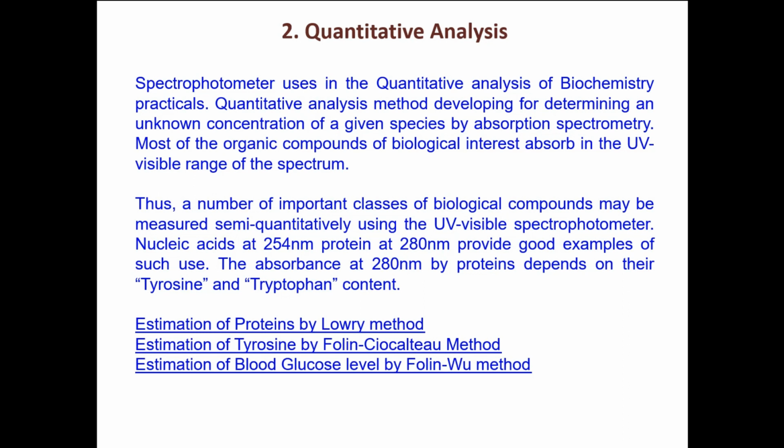Okay, so how can I characterize or estimate the activity of the enzyme in this reaction? LDH is lactate dehydrogenase. It is engaged in the transfer of electrons from lactate to NAD plus. The products of the reaction are pyruvate, NADH, and a proton.